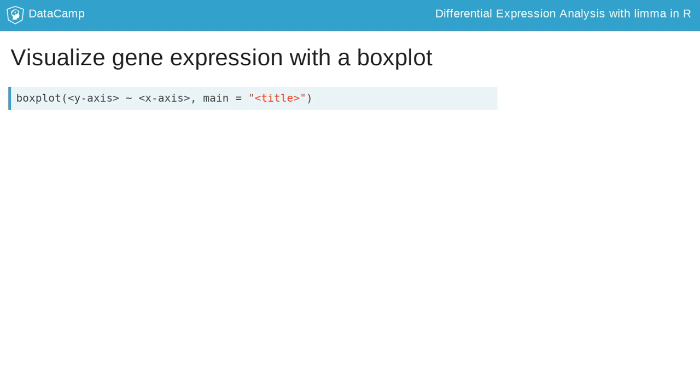To create boxplots of a single gene, you insert the gene expression to the left of the tilde, the phenotype variable to the right, and use the feature data to label the title of the plot.